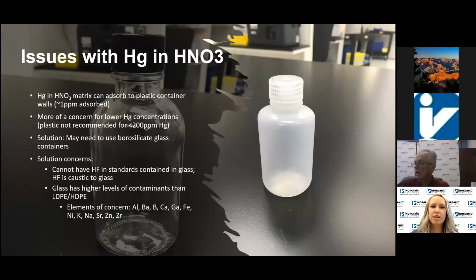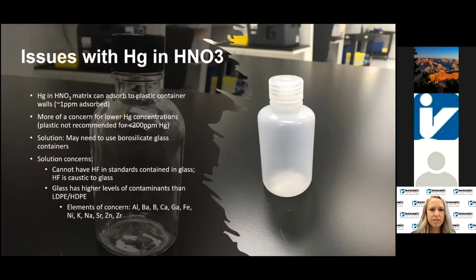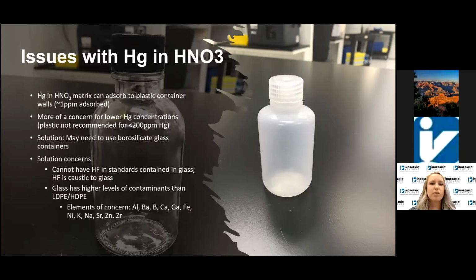So what type of matrix do we want to use for mercury? Well, a lot of analysts like to use nitric acid for their matrices because it's not going to have interference issues in your ICP. But there are issues for using nitric acid alone for stabilizing mercury. So in nitric alone, mercury will adsorb to the walls of plastic containers. So this is really going to be mainly a concern for low-level mercury standards. We generally don't recommend using plastic containers for mercury standards in nitric alone at 200 ppm or lower.